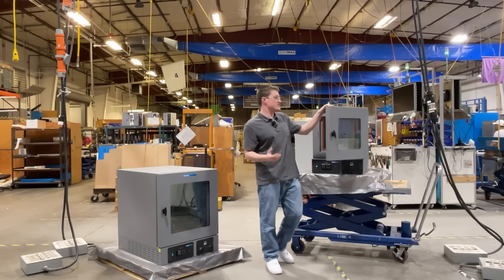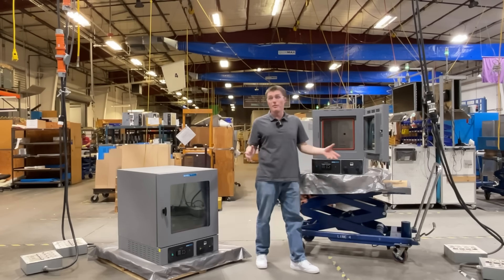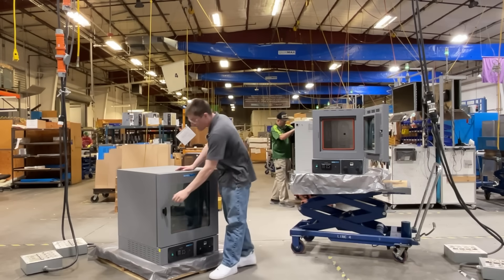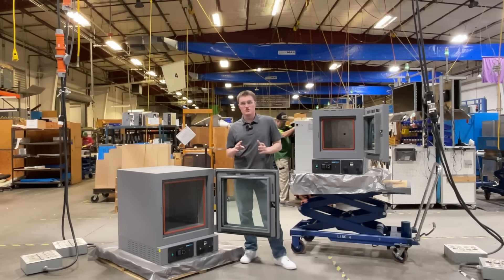The first thing you will notice is the unique double-glass door construction. Similar to double-pane windows, this provides excellent insulation between the inside and outside atmospheres. Additionally, you will find ample space in both for the three included shelves.